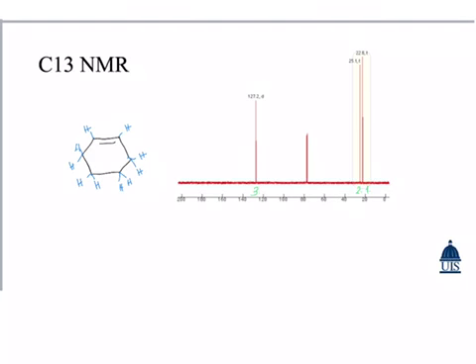The first thing we're going to do is split our structure around here, followed by another split around here, giving us 1, 2, and 3 carbons. This one has 2 hydrogens attached to it. This one has 2 hydrogens attached to it, and this one has 1, which is the one connected to the double bond between carbon and carbon.